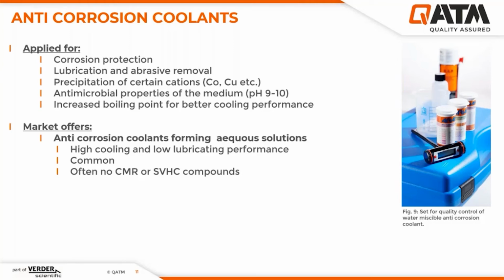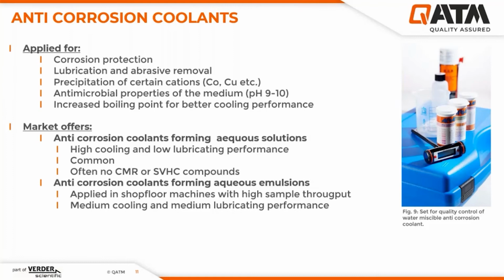The market generally offers aqueous anti-corrosion coolants that form aqueous solutions, which are the most common class of anti-corrosion coolants on the market. And these are also the anti-corrosion coolants QATM distributes. Modern products do not contain any CMR or SVHC compounds like boric acid anymore and are quite safe to use.